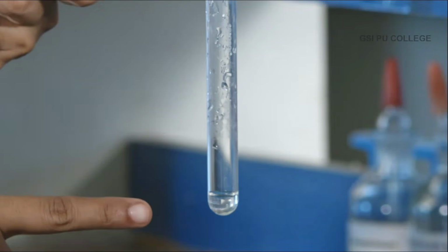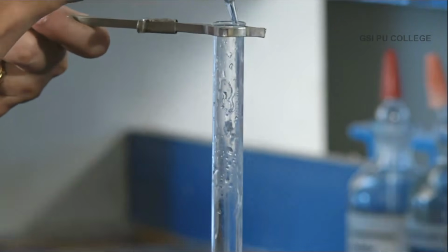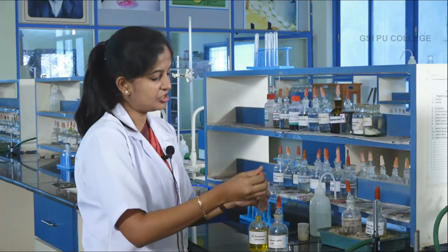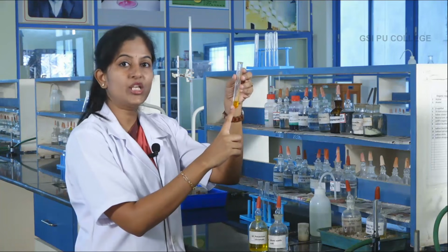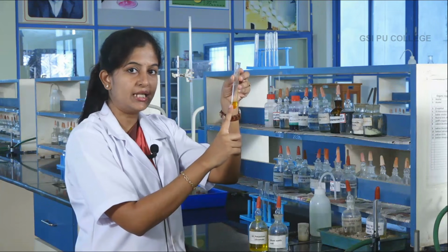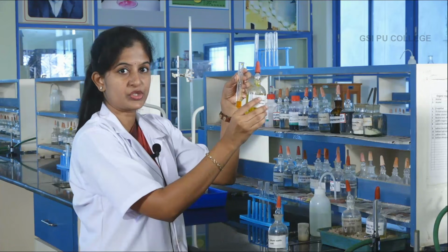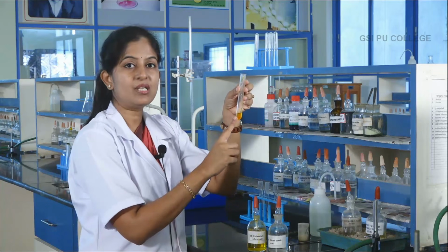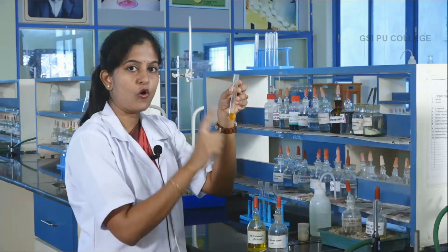So, take a small amount of original solution to which add dilute acetic acid followed by potassium chromate solution. You can observe that there is no yellow precipitation. It has become a yellow solution, but it is not a yellow precipitate. It is almost a yellow solution, so hence it is not a yellow precipitate. So, barium is absent. So, no need to make the flame test for barium. Go for the test for strontium.